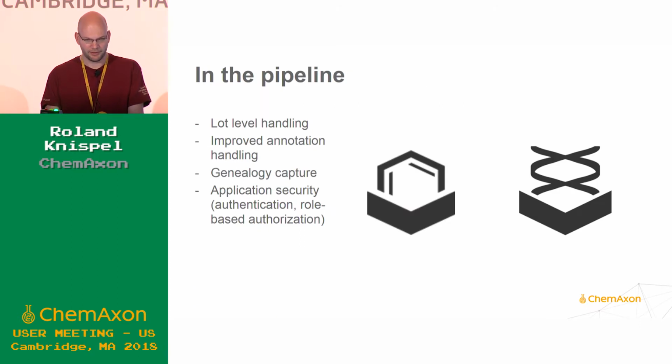What's in the pipeline here? So we're working on fledging out the registration system capabilities. We're essentially in the process of transitioning from a toolkit to something that you can grab and deploy as a registration system.